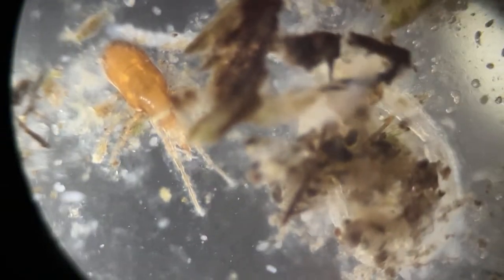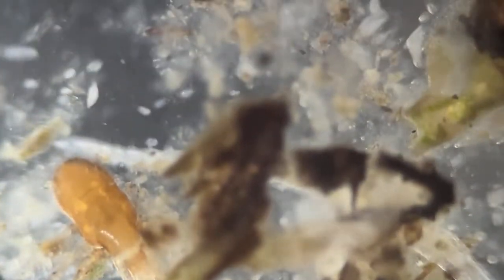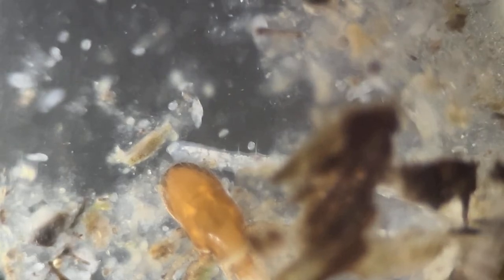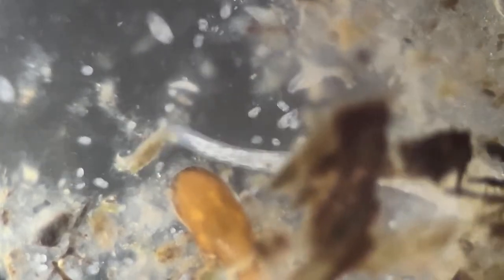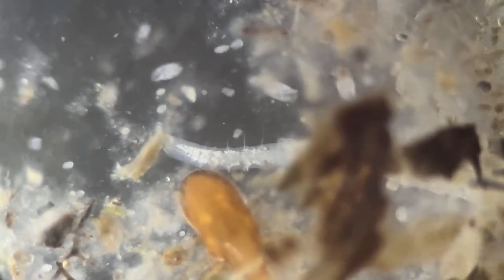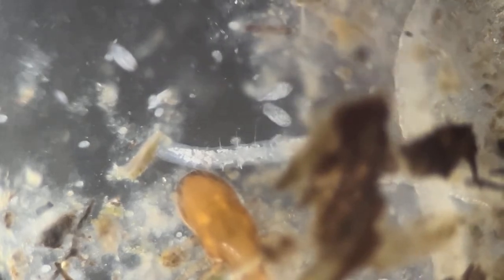I'm looking forward to a clear, undebrided view of this little worm behind the tick, because you can already see those eggs arranged in the body all along the alimentary canal. There's a large number of eggs. So the fecundity of this animal, you can just imagine. All right, probably it's coming out of the debris now.